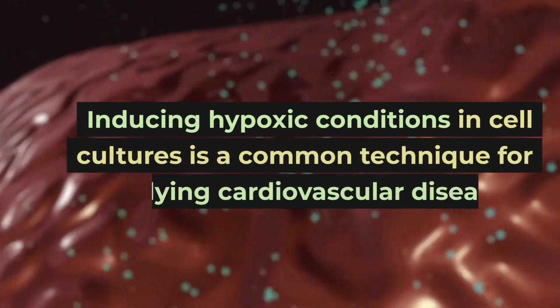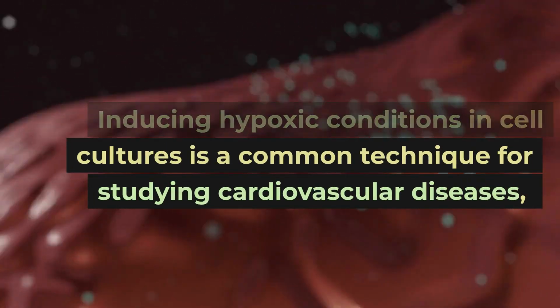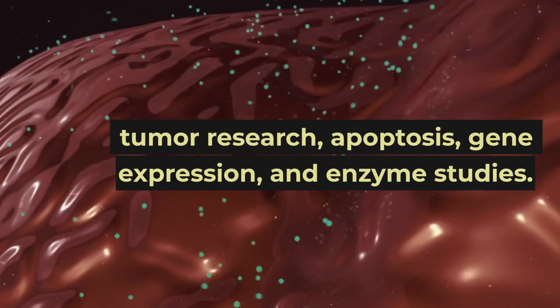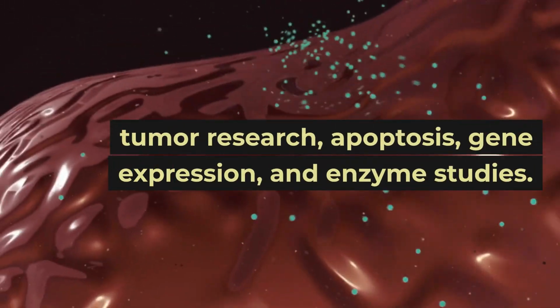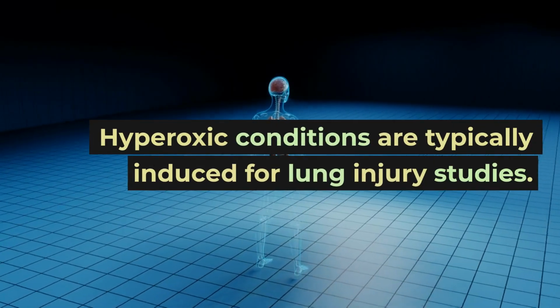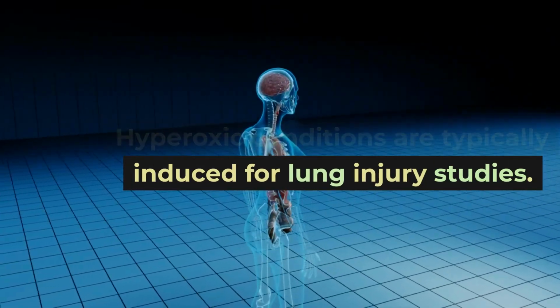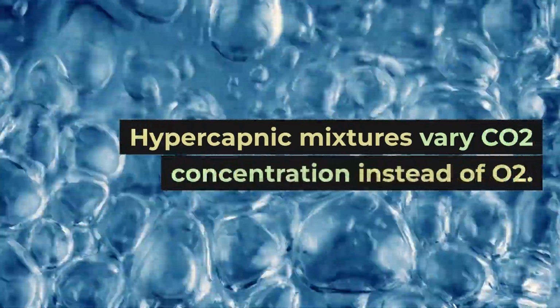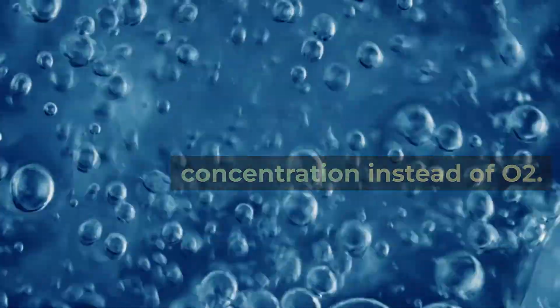Inducing hypoxic conditions in cell cultures is a common technique for studying cardiovascular diseases, tumor research, apoptosis, gene expression, and enzyme studies. Hyperoxic conditions are typically induced for lung injury studies. Hypercapnic mixtures vary CO2 concentration instead of O2.